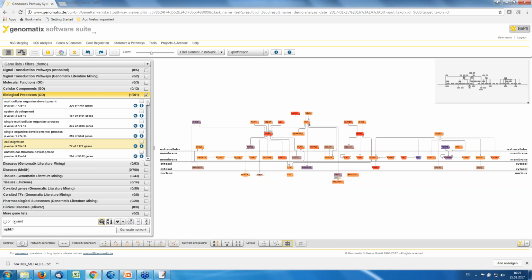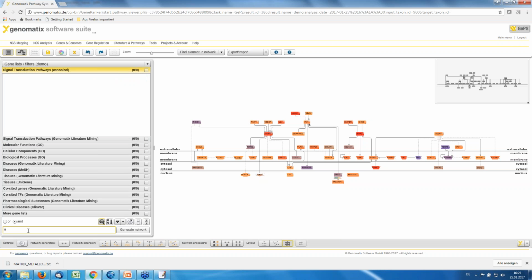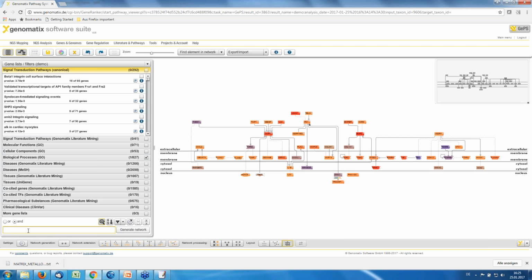Details about the networks we can look at with another network actually. So let's start by just removing the filter here. Let's start with the canonical pathways. So we're now in the second part, networks. Canonical pathways, how do we display them? I mentioned that you can use this P button for it.